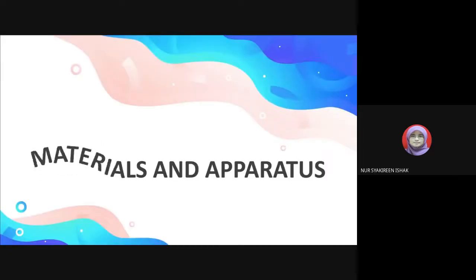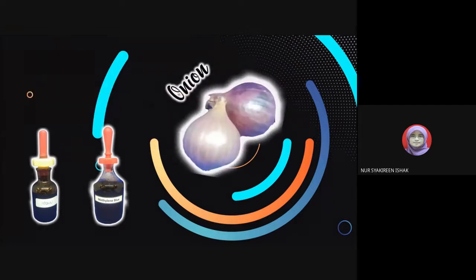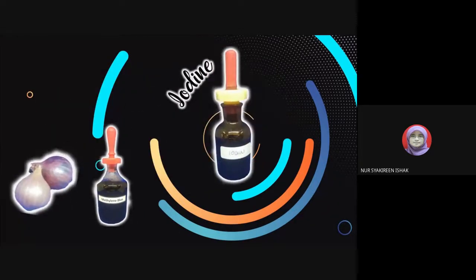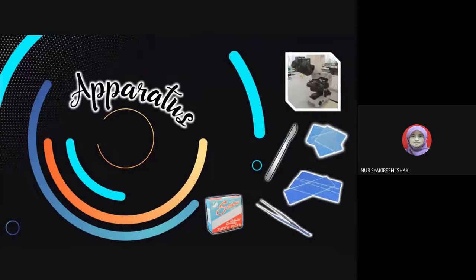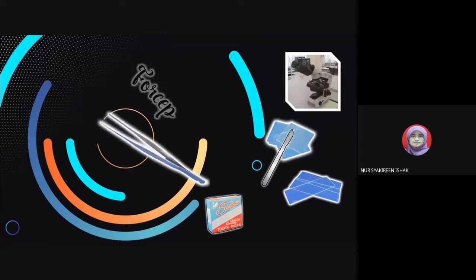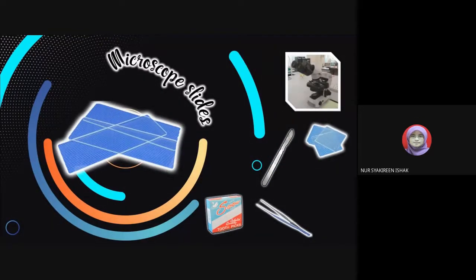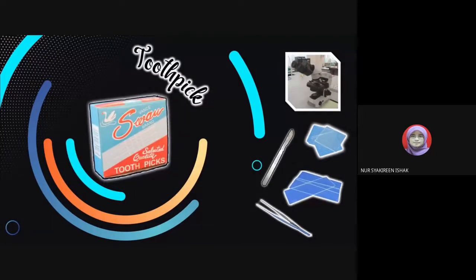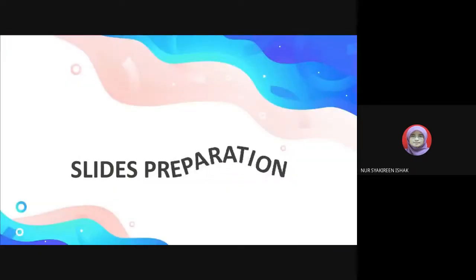So first of all, let's start with the materials and apparatus needed. There are 3 materials needed in total. They are onion, iodine, methylene blue. 6 apparatus to complete this experiment. The first one is scalpel, forceps, cover slip, microscope slides, toothpick, and a microscope. Now, let's start preparing the slides.